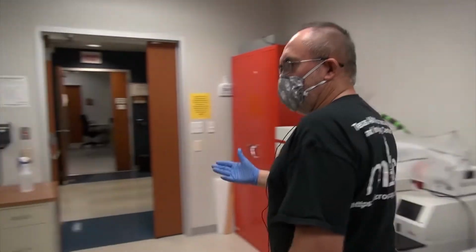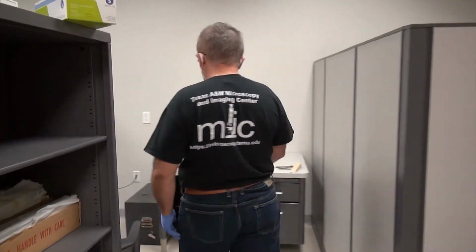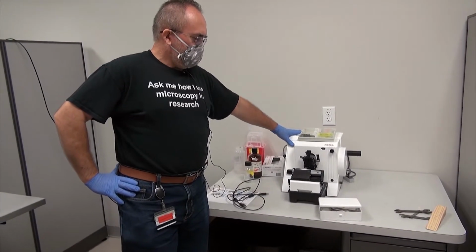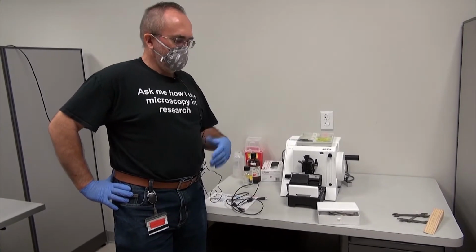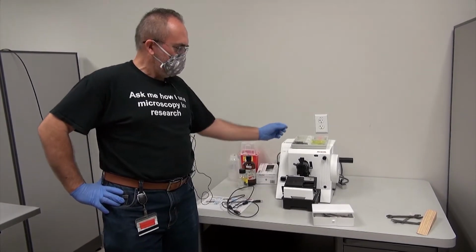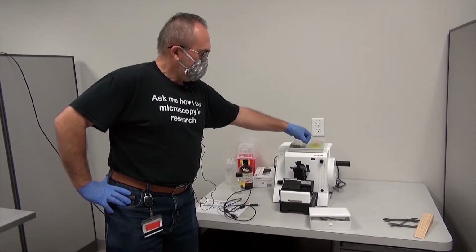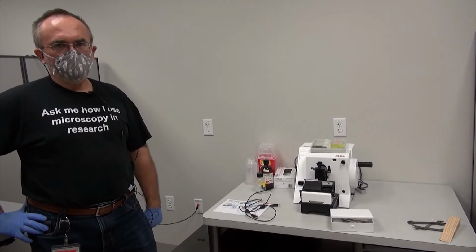So in addition to the ultramicrotome, we also have some tools for optical microscopy and histology. This is a regular rotary microtome that allows sectioning of wax-embedded samples. Typically, you would make sections several micrometers thick and put them on a slide. And these can be then imaged after staining on our optical microscopes.